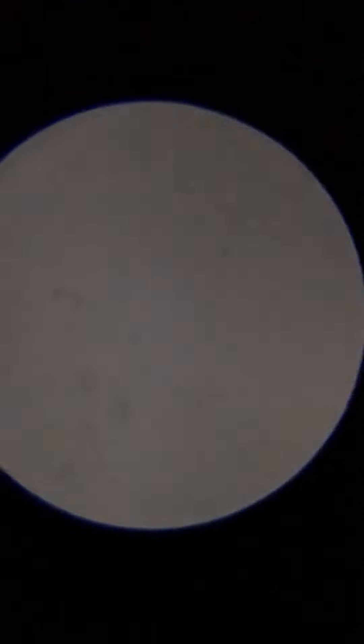I'm just going to put my phone back on and then I'll do 640x. I'm on 640 right now, I just got to get it zoomed. I don't know why I can't focus, guys. This is... wait, I'm just going to check. Yeah, this is 640.